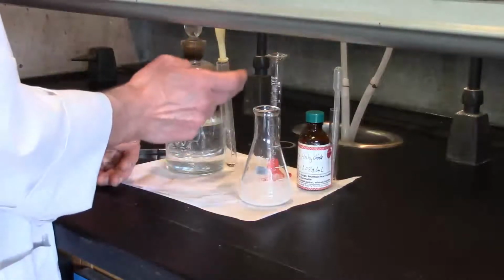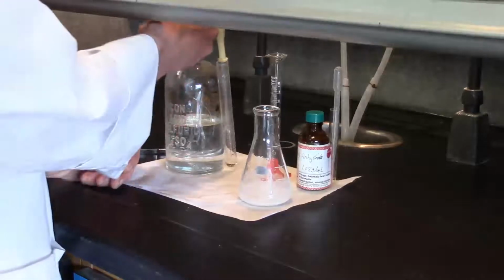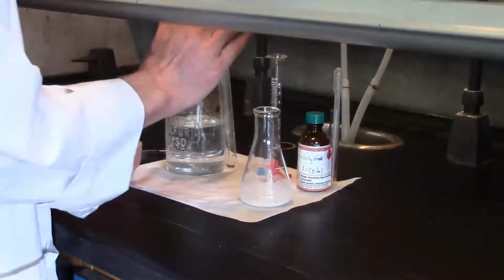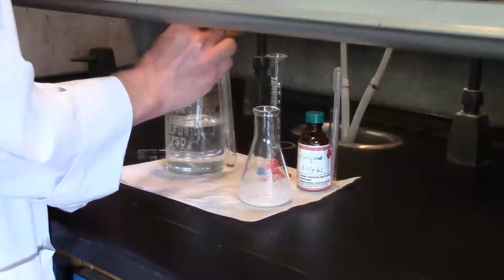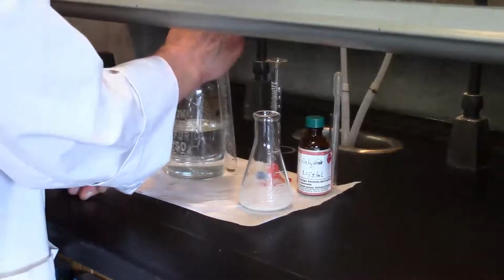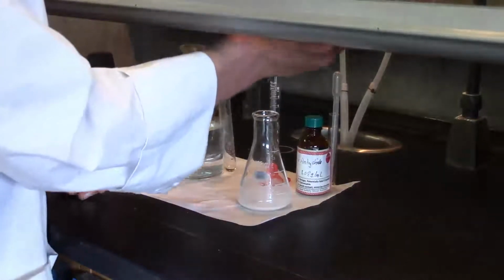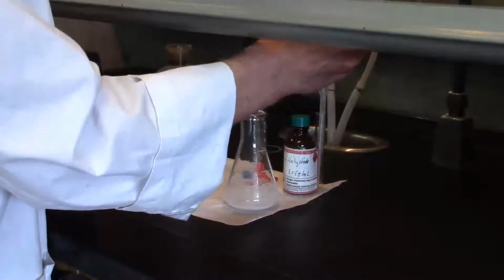So I have here a Pasteur pipette from which I will collect the 5 drops. Right, so you can see what I'm going to do is lift the lid this way. I don't want to really put down this lid anywhere, so I'm holding it between my fingers. I'm going to reach in and suck up some of the concentrated sulfuric acid. Now it's a very viscous liquid, so you won't get very much when you suck up, but you don't need very much, just 5 drops.